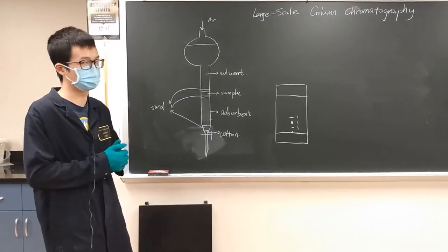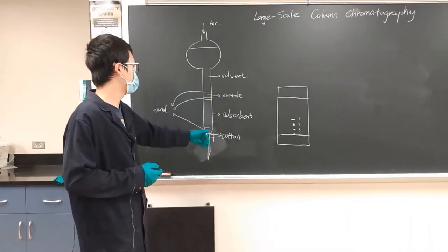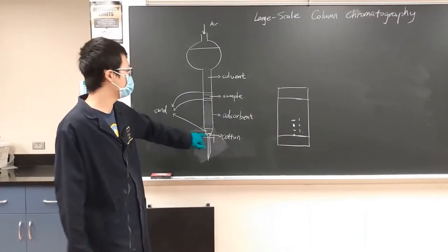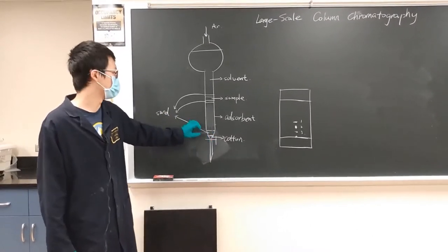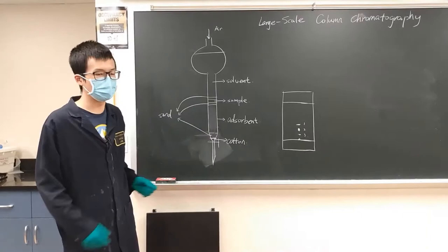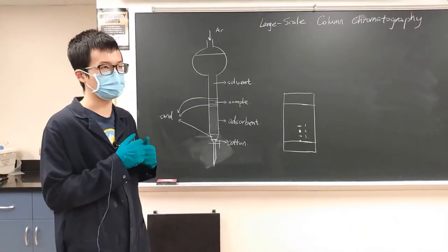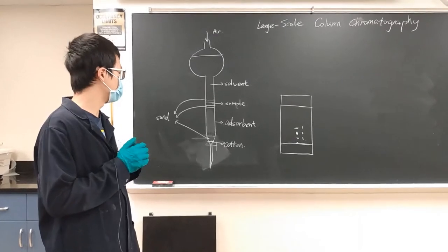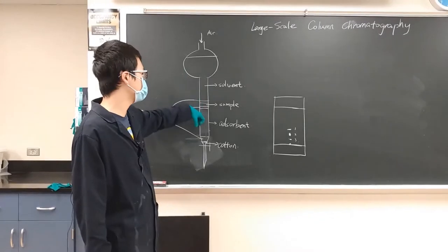Here is how we load this column. At the bottom we need some cotton, then we put some sand on the cotton. Then we mix the silica gel with a nonpolar solvent, which is hexane or other nonpolar solvent, to make it into a slurry and pour it in.